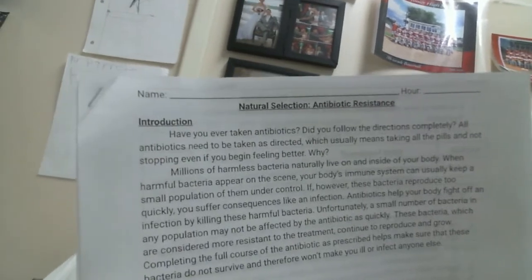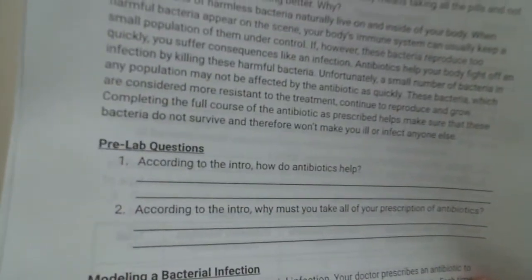First thing you need to do is read the introduction because there's 2 questions you need to answer about bacteria and antibiotics, because that is what the lab is about today: seeing how resistant bacteria are to certain antibiotics and how that will affect them in the long run in terms of natural selection. It is their ability to be resistant to certain drugs and mutate that resistance that makes them a perfect candidate for natural selection to choose which ones are more fit to survive than others, because our drugs don't work on them anymore. So we're going to take a look at that today.